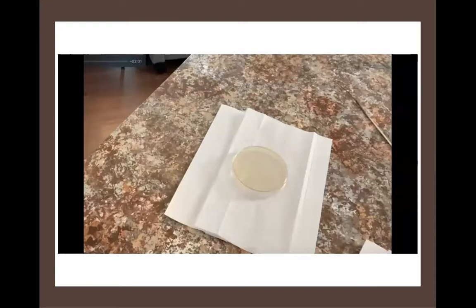And what this does is it allows any condensation that might develop inside that nice warm incubator to drip off of the surface of the agar and onto the lid of the plate. This is helpful when we're trying to grow bacteria because that condensation might interfere with the growth of bacterial cells on the agar surface. So we handle them upside down, we open and close them upside down, and we place them into the incubator upside down.